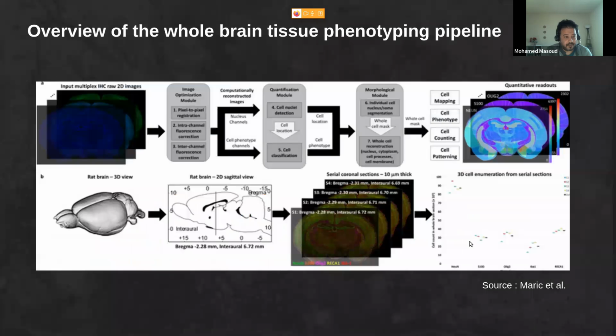An overview of the whole brain tissue phenotyping pipeline used in this paper is shown here. I will talk now about the upper part, which consists of a raw high-content 2-dimensional multispectral imaging data set.